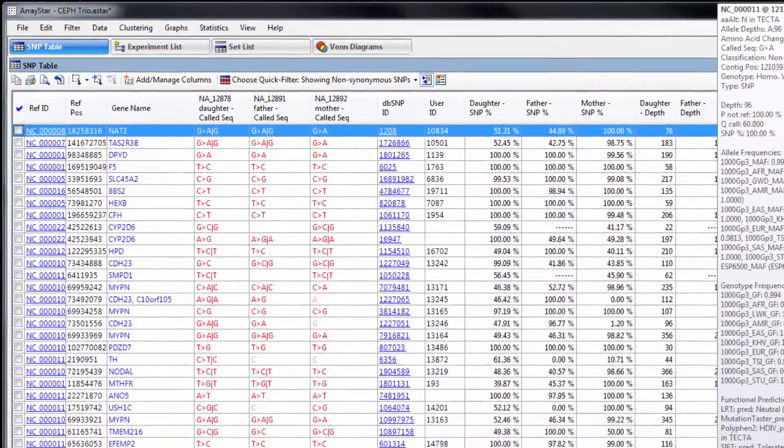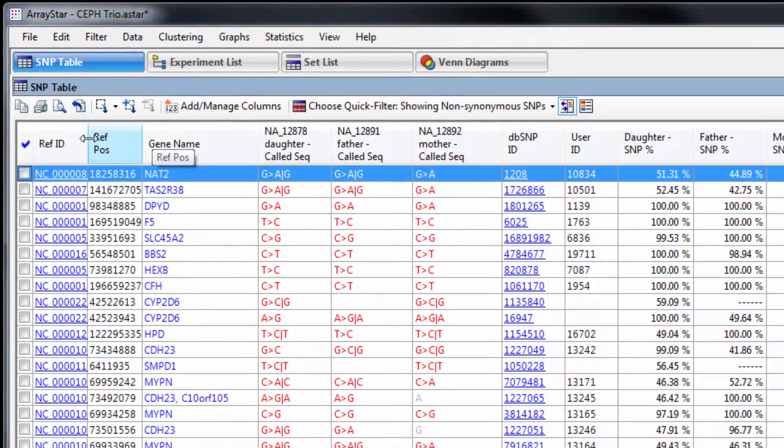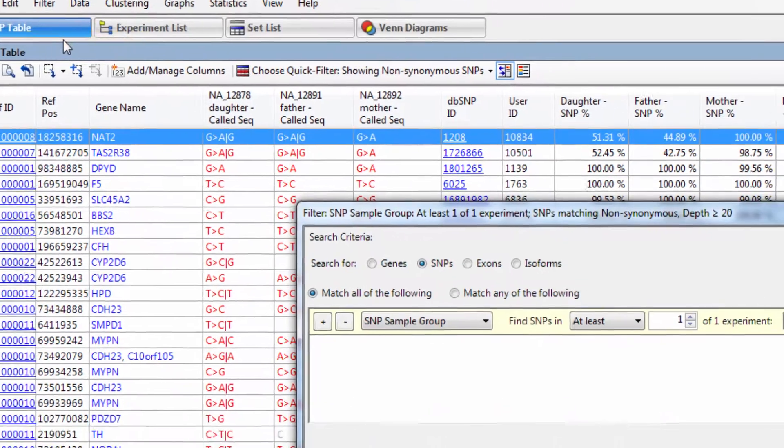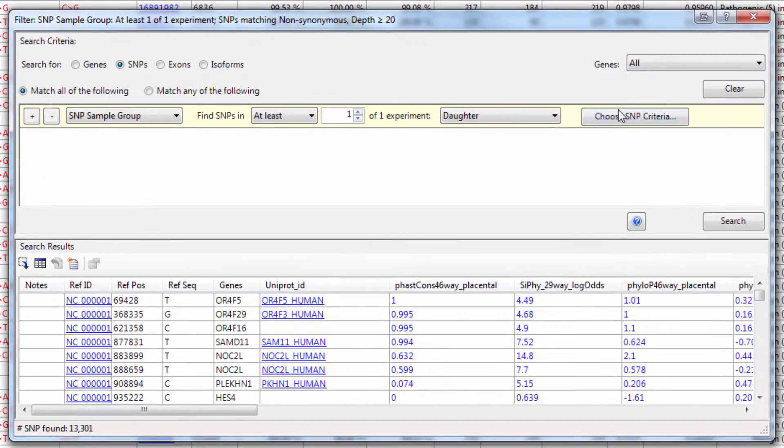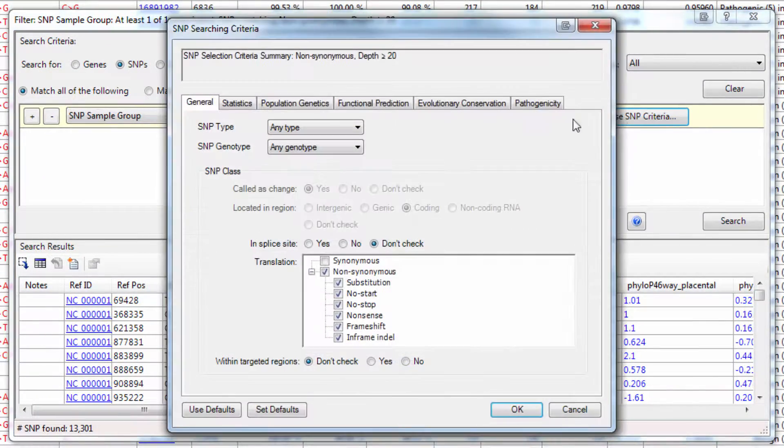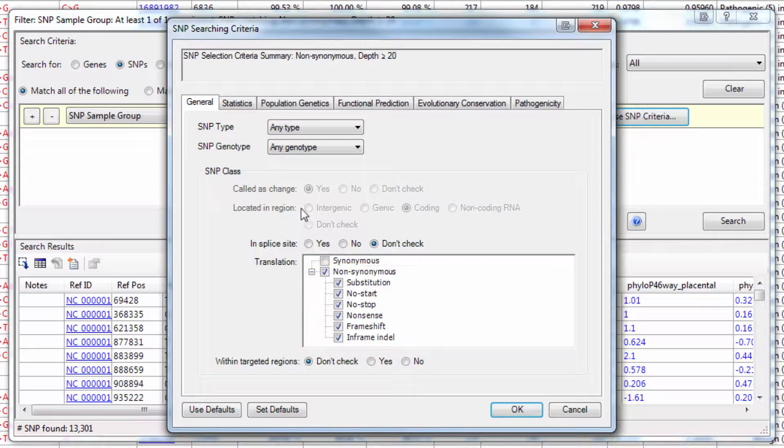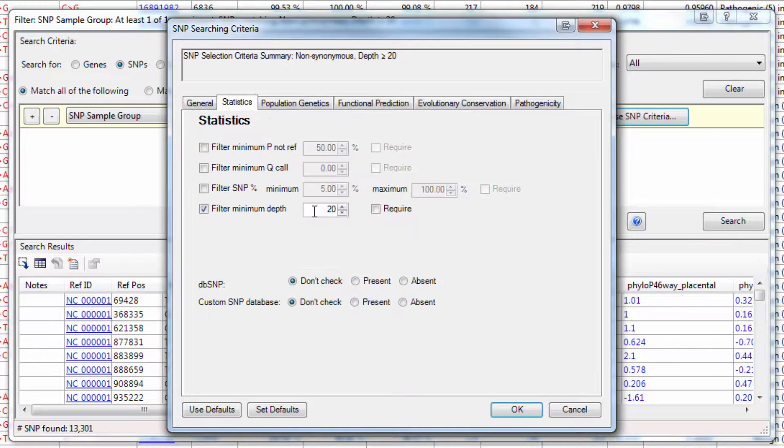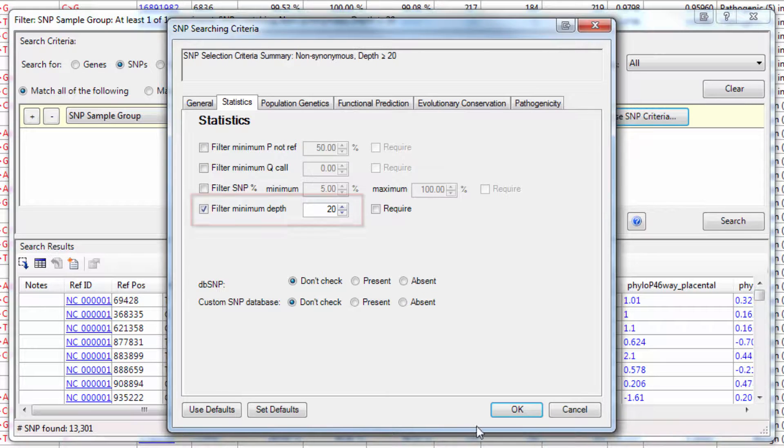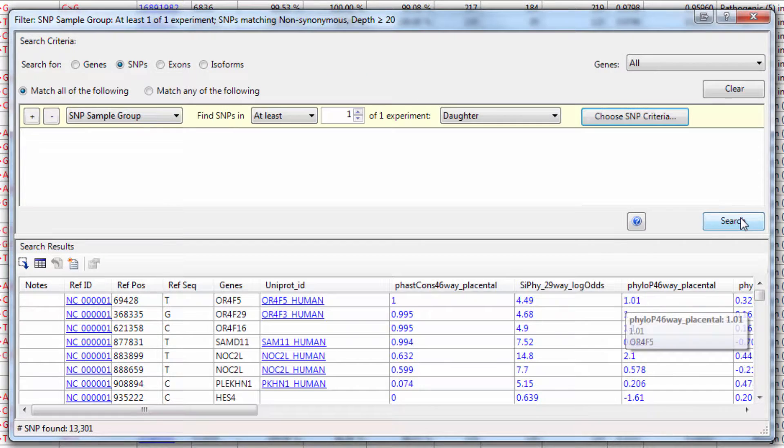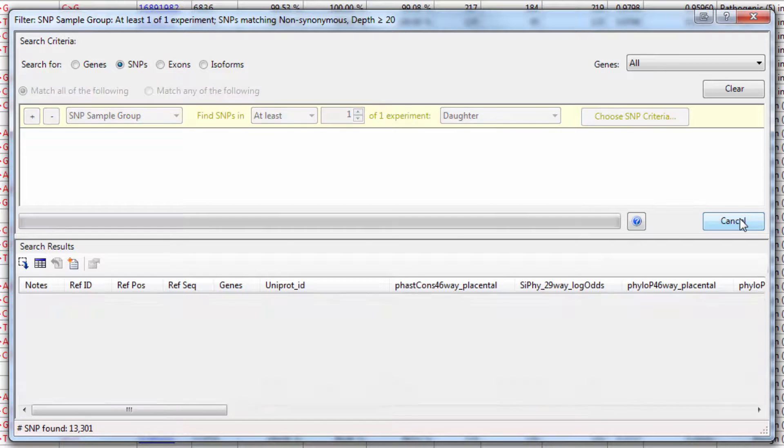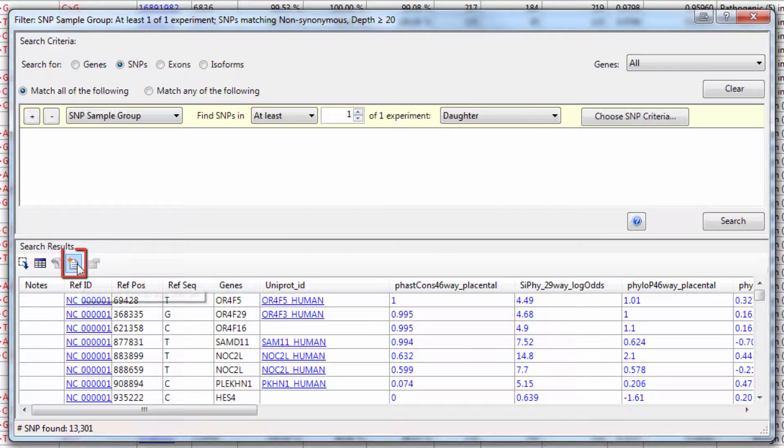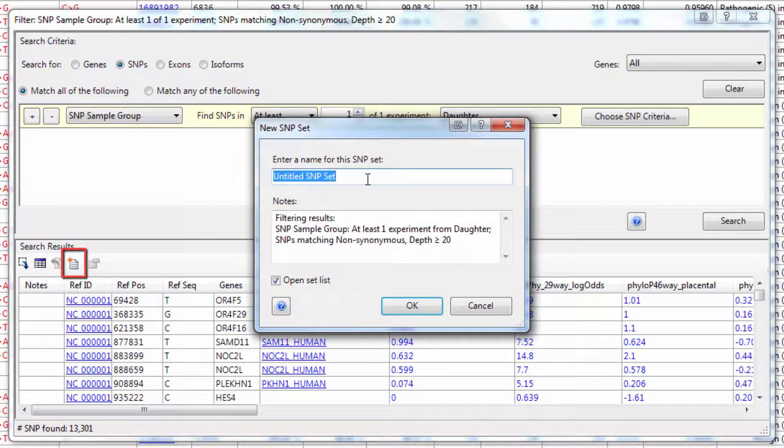To really filter down to SNPs of interest, I'm going to use the Filter, Filter All option. And then I'm going to specify my SNP criteria. So for this example, I want to look for non-synonymous SNPs that occur in the daughter and also occur in areas with assembly coverage of 20x or more. So I'll do this search and then save this as a SNP set.